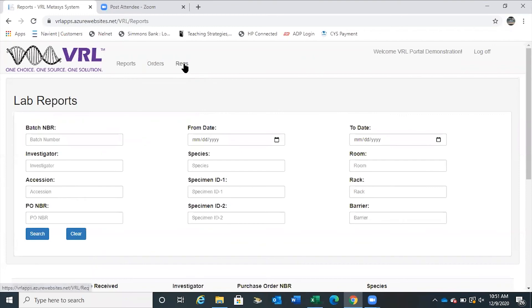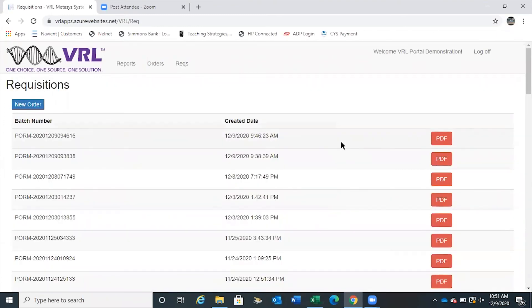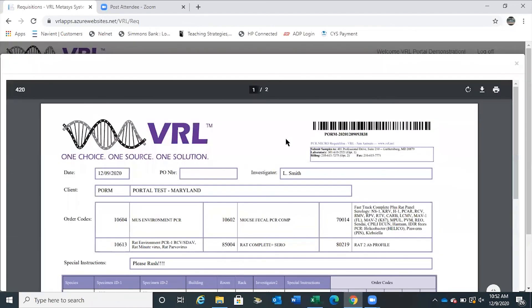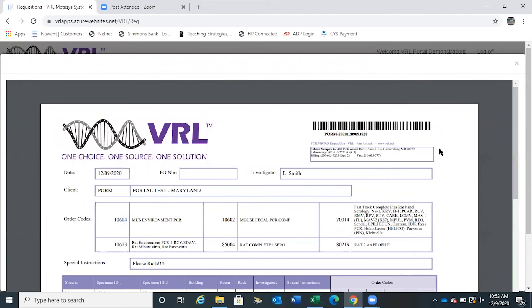Within the portal, there is a requisitions page where you will see all your requisitions submitted to VRL, captured in chronological order with both time and date stamps. Once you have completed your order, click on the PDF generated for that order. Once you hit submit on the online portal, that data has been given to the laboratory. The PDF that is generated then has to be printed off and placed in a box with the samples. The barcode at the top is tied to your submission — once we receive this box, we will scan the barcode, verify your account in the computer, and verify all your samples in the box to make sure everything matches.